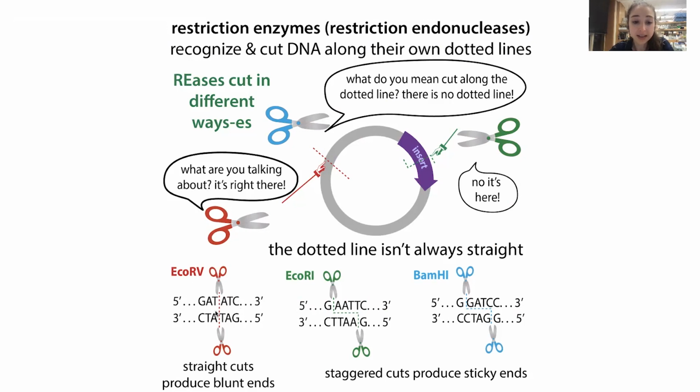So they're read the same on both strands, because when you think about reading, you're talking about 5' to 3'. And the restriction enzymes that we typically use are type 2 restriction enzymes. There are some restriction enzymes that cut outside of the sequence they recognize, and there are some weird types of restriction enzymes. But the type we typically use in the lab recognizes a specific sequence and then cuts inside of it.